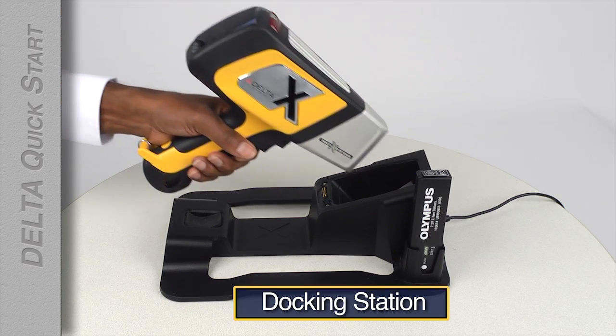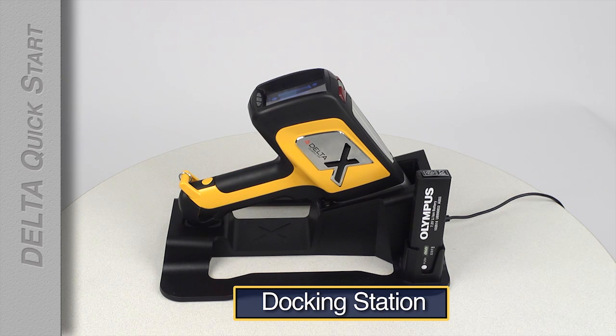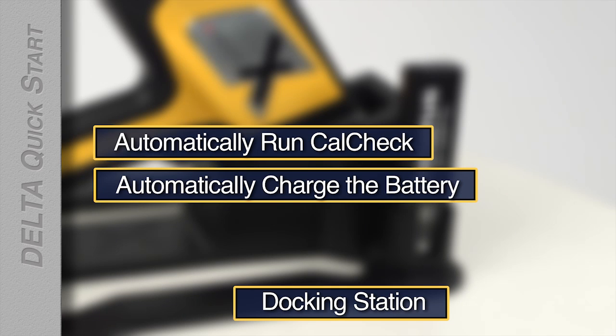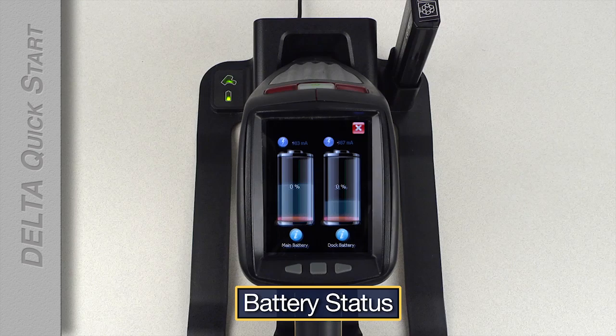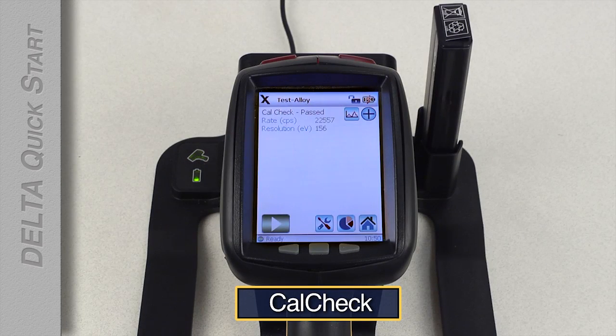When you are not using the Delta for any length of time, place it in the docking station. The docking station will automatically run a CalCheck, automatically charge the battery in the analyzer, and automatically charge the backup battery. As long as the analyzer is powered on, the docking station will recognize it. The status of both batteries will be displayed on the analyzer screen, and a CalCheck will be performed automatically.